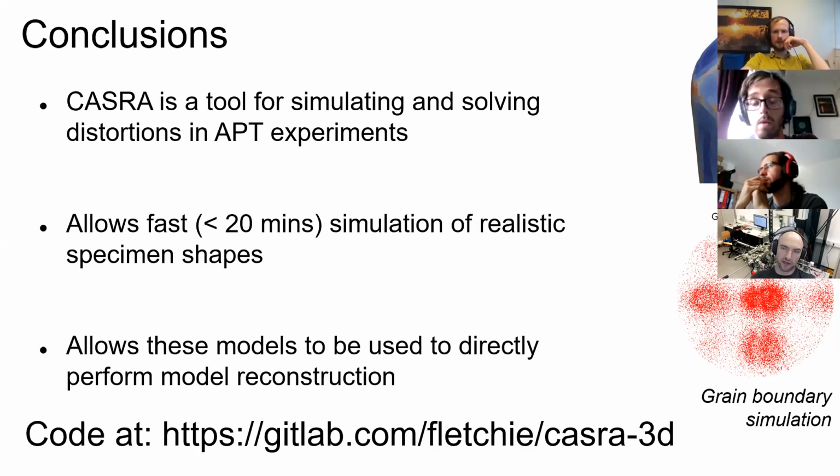Have you had a look at the numeric variations at the larger elements? What kind of variations would happen there? Because there could obviously be numeric instabilities in pinch points. Yes, so I have a little bit, not in too much detail, but it is something that does arise. If your triangle size increases too rapidly down the shank, then you do end up with a very poor quality solution at the apex. So yeah, the problem becomes very poorly conditioned.